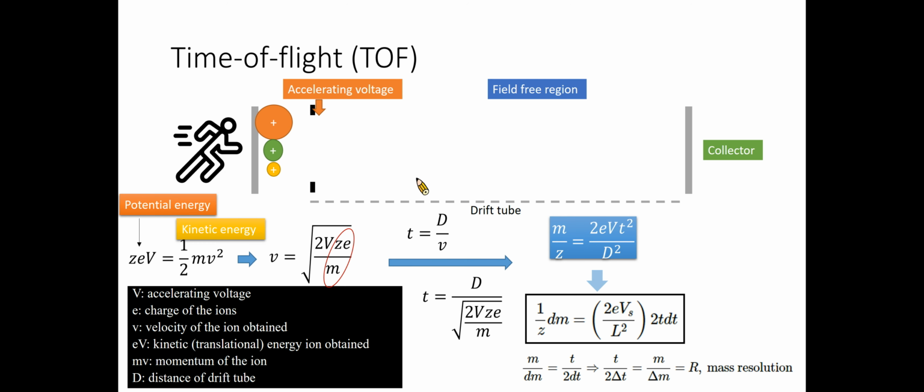The principle of the time-of-flight mass analyzer involves the separation of ions based on the time it takes for the ions to travel through a flight tube with a known length and reach the detector. The trajectory of the ion through the TOF mass analyzer depends on its momentum and kinetic energy due to the applied pulse acceleration voltage and mass-to-charge ratio of the ions.